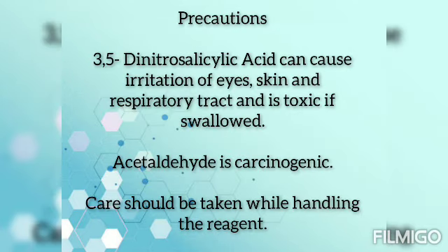Then precautions we have to take during the practical: 3,5-dinitrosalicylic acid can cause irritation of eyes, skin and respiratory tract and is toxic if swallowed. Acetaldehyde is carcinogenic, therefore care should be taken while handling the reagent.